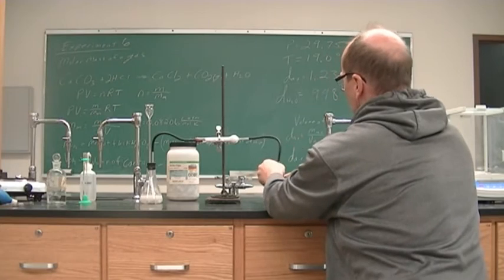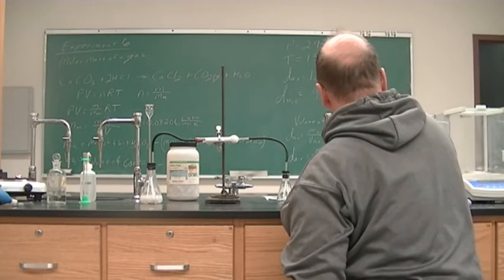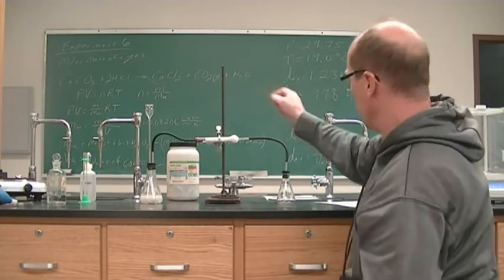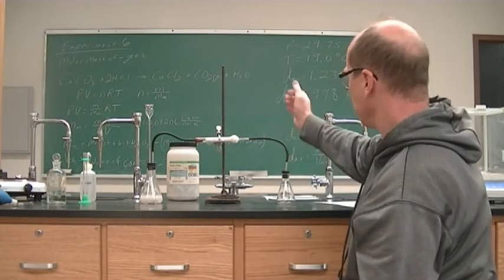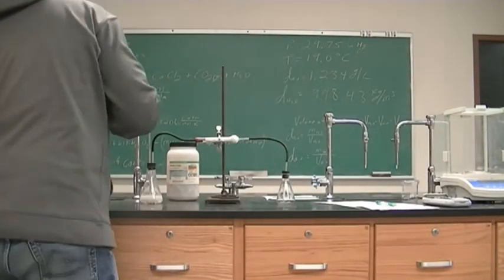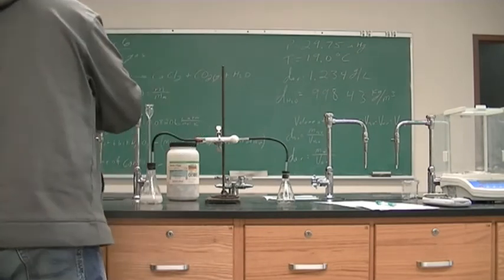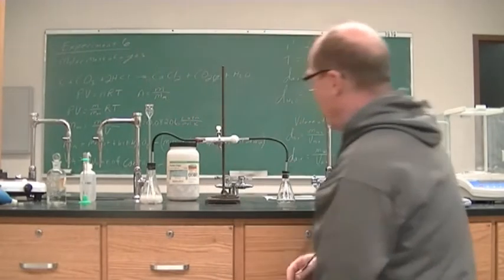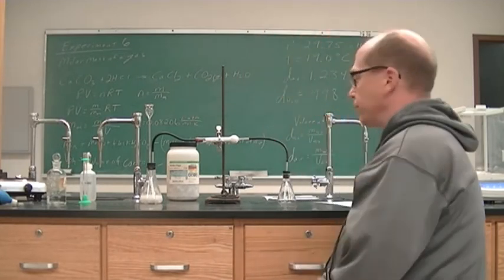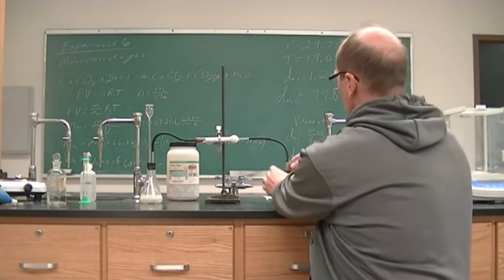I thought that would have been the same. It is still increasing. So 69.2325 is our mass at this point. All right, so, well, I thought it was our last shot of HCl. It is not. All right. Lots of CO2 being generated. All right, let's go ahead and weigh it again.